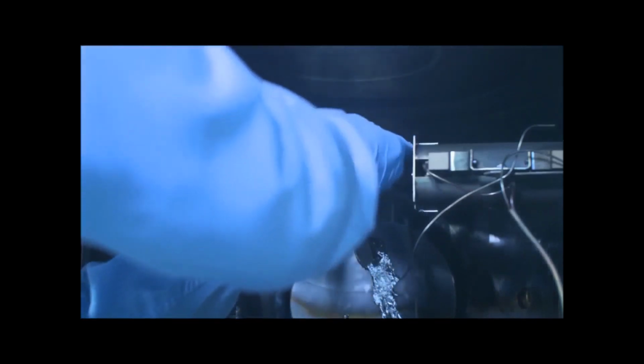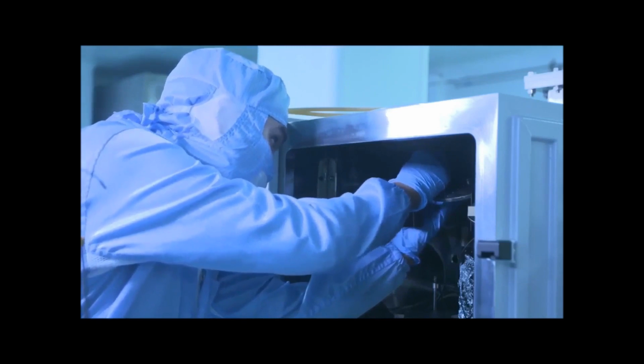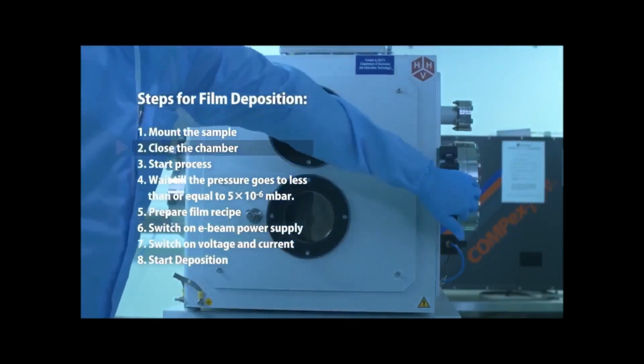We have to tighten this screw using the Allen key. It can be rotated 360 degrees, so we can put it at any angle to get the deposition. Let's put it at 90 degrees towards the target material for our deposition. Now let's close the chamber. So we have closed our chamber.